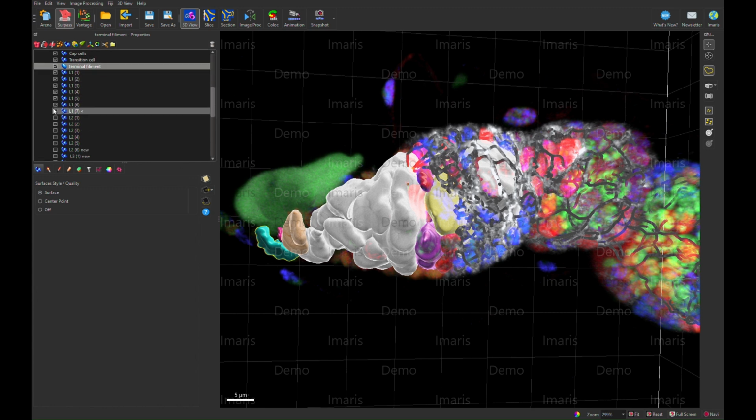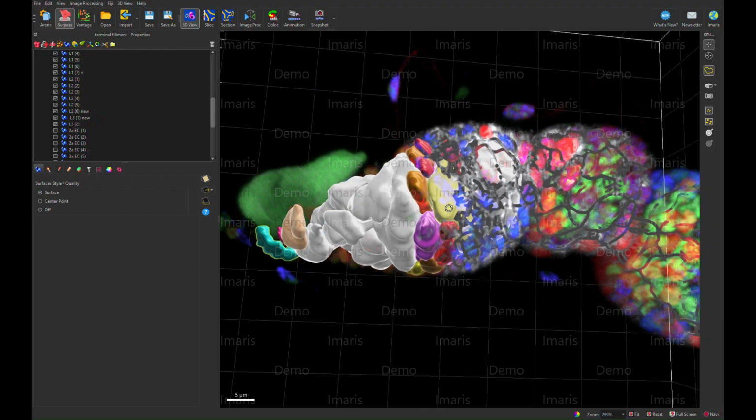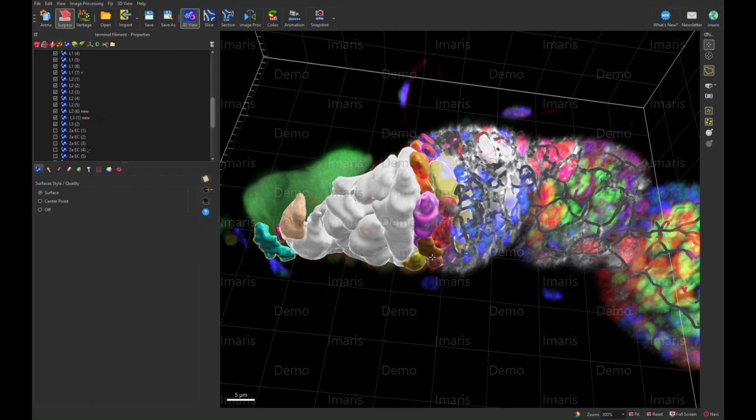And then directly anterior of them are going to be the orange layer 2 cells. So now this is a whole cell body away from the Fas3 protein on the anterior side of those red layer 1 stem cells, follicle stem cells. And lastly, of the stem cell layers, we have the third layer, which I've labeled in yellow. We've got one hiding back here behind that layer 2 cell. So that's going to be 2 cell bodies away from the Fas3 protein, right anterior of the orange layer 2 cells, and near the region 2A cysts here in white.